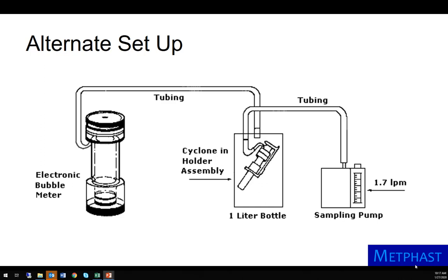Sometimes it's difficult to connect the meter to the inlet of the sampling train. For example, here is a respirable cyclone and a filter cassette assembly. Given difficulties in attaching tubing to the inlet of the cyclone, the entire sampling assembly is placed within a bottle. In this way, the bubble meter can be connected to the bottle rather than the cyclone. The same procedures mentioned for the soap bubble meter are used to determine the air flow.